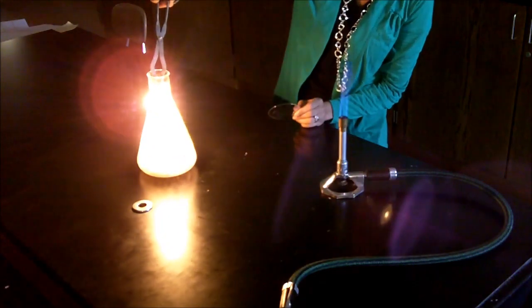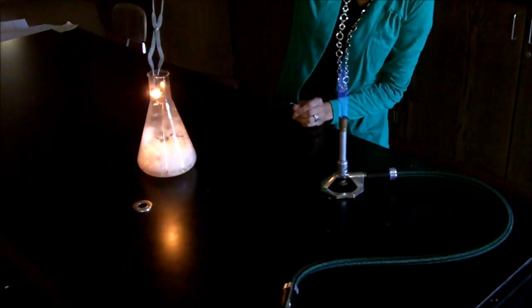If you notice, the oxygen-rich environment tends to show more glowing with the steel wool.